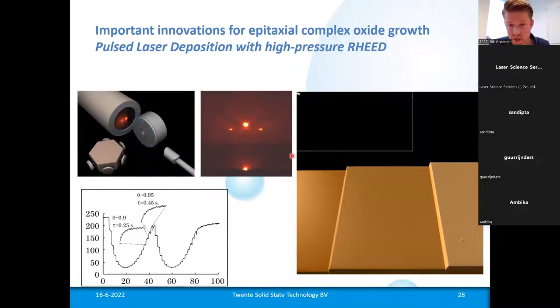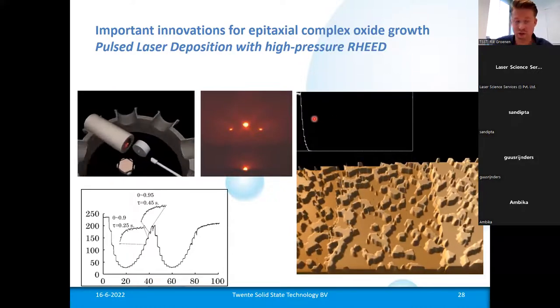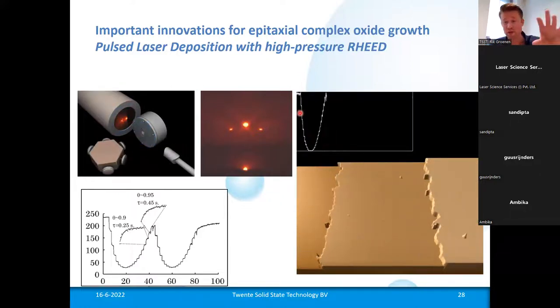Can I show this video? An oscillation would really represent a single monolayer of growth. And we started to model this. There is a lot of information in there. So you could actually observe the single pulses.